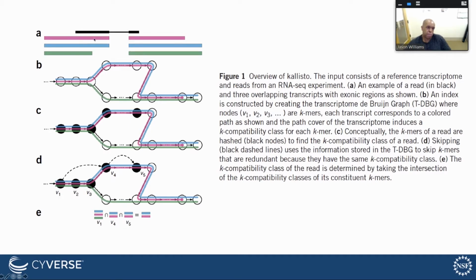could not have generated this read in black, then it basically says, why bother to count? Why bother to do the alignment to the rest of the transcript? If 60 base pairs in I realize that this transcript could not have generated this read, I'll stop looking at it and I'll look for another transcript that could have. What this ends up doing is it's an enormous time saver, and it actually increases the accuracy, and it's very robust to sequencing error, because any given error that you might have in a read is unlikely to cause you to mess up this process and erroneously discard it.